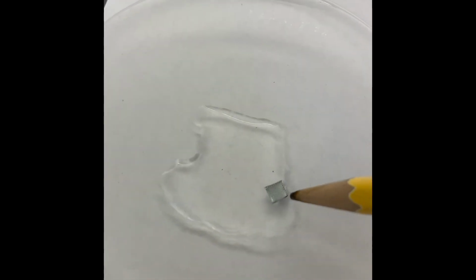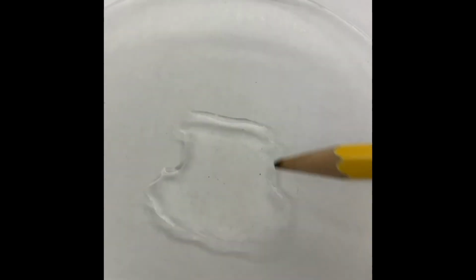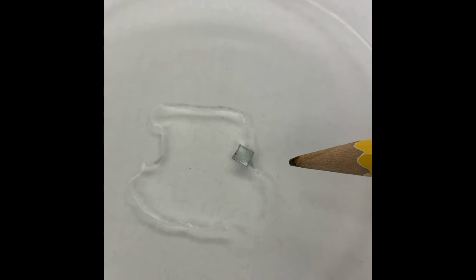Let's flip that thing over. There we go. Not much on that side either.